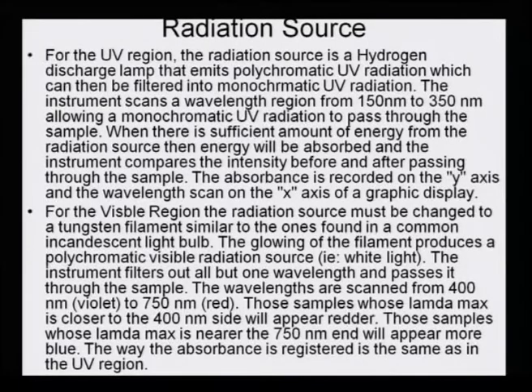So, the light status before and after the absorption is compared, and whatever is absorbed is considered to be absorbed due to the presence of a chromophoric group in the molecule. So, that part remains the same.